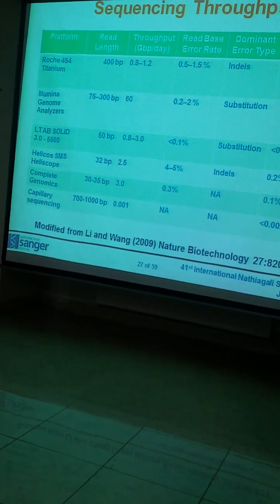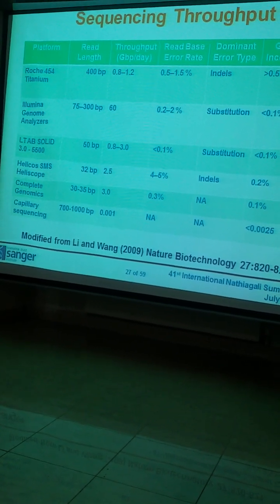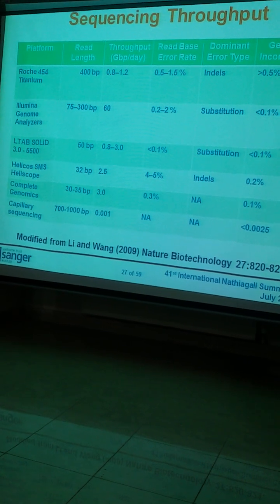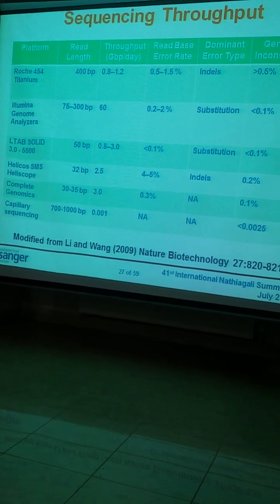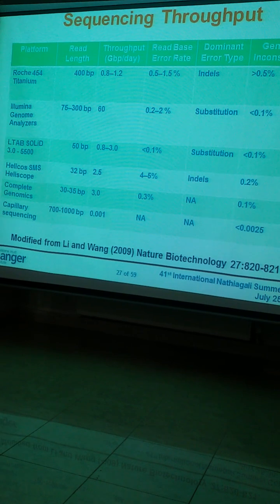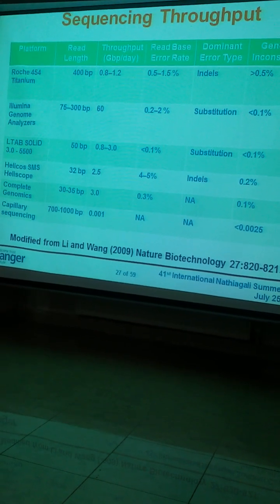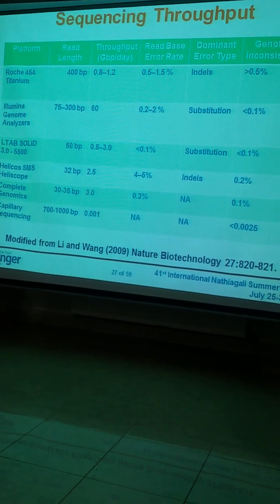How can we calculate the error rate in our own experiment? We have some data from Illumina. What Sanger does every time they get a new instrument is use a YRI trio, which has been sequenced on almost all different platforms. There's a paper in bioRxiv, I don't think it's been published, called Genome in a Bottle, and they compared those same three individuals, mother, father and child, across all those instruments. They also have very good Illumina genotypes for those samples. So they look at discordance between the sample and sequence, look at the overlap, which are called correctly and which are not, and then estimate the error rates and false discovery rate based on that.